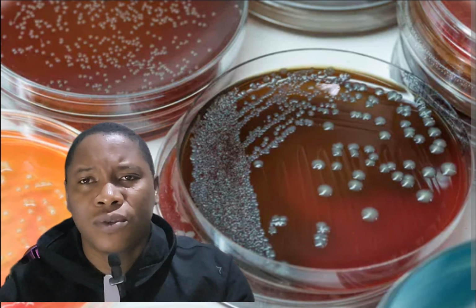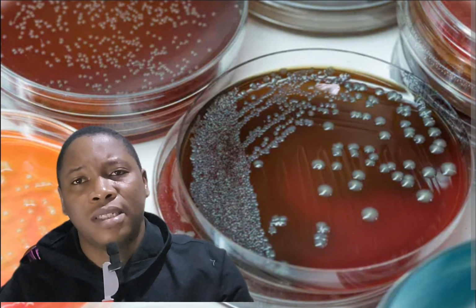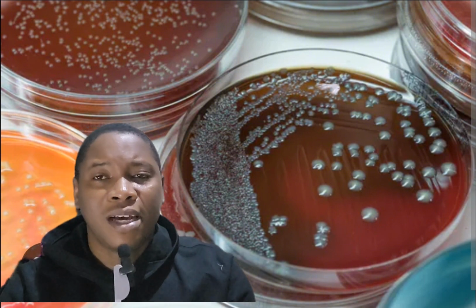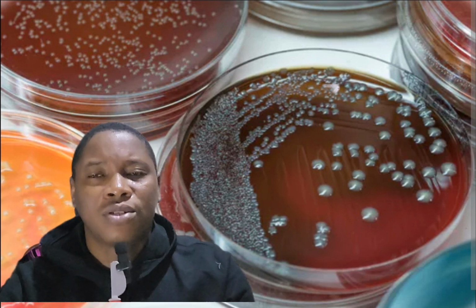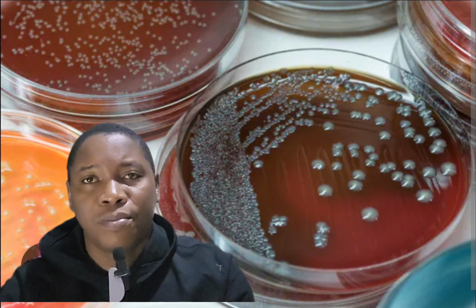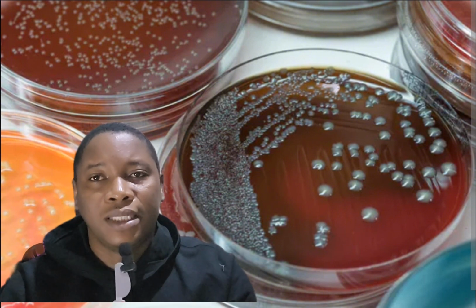So you can have samples from different kinds of places. And remember that microbiology has different aspects. There are different aspects such as agricultural microbiology, medical, aquatic. So we keep taking samples from different places and then culturing them in the laboratory.